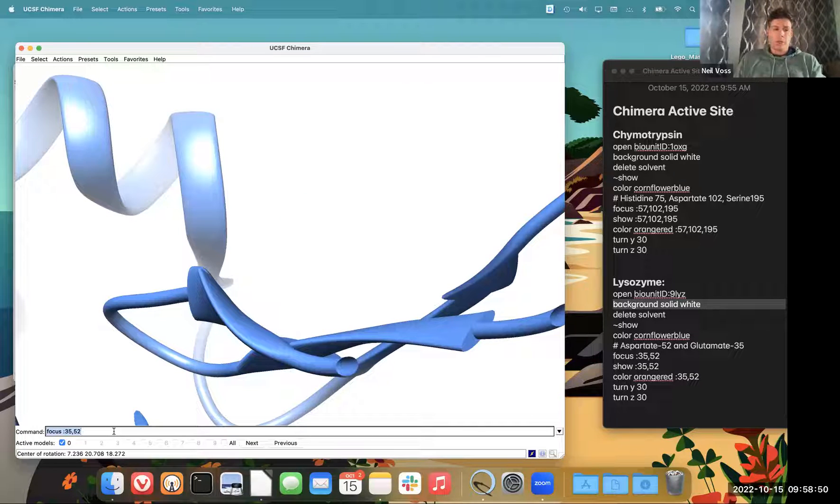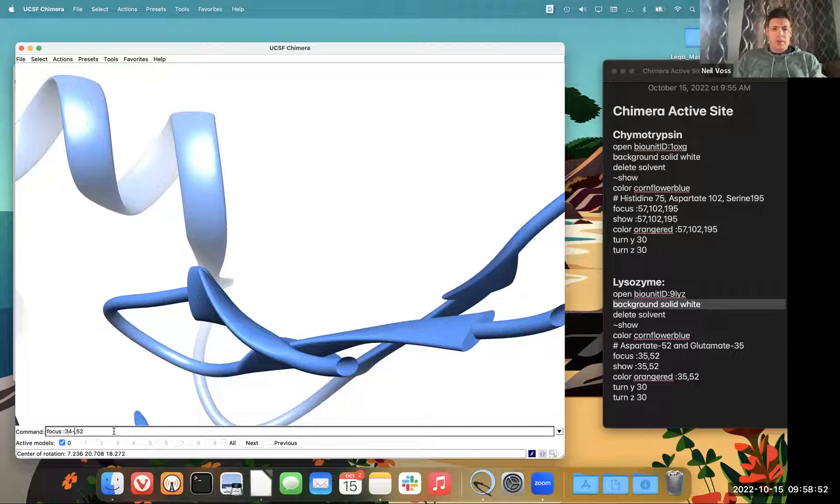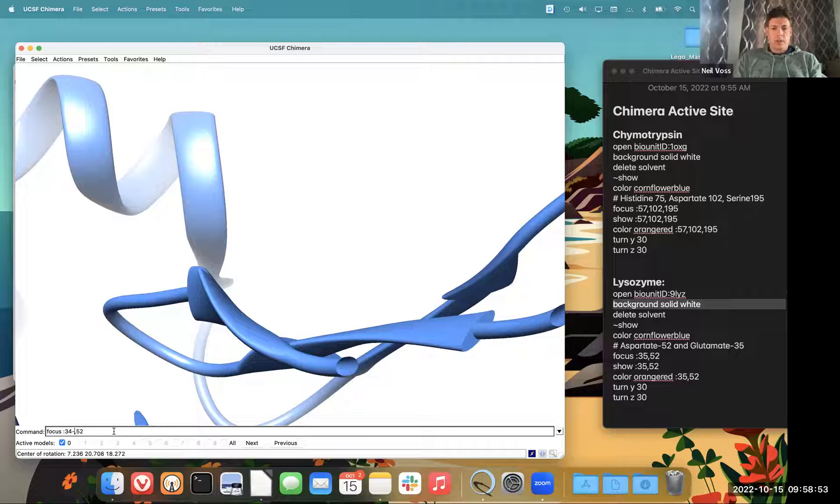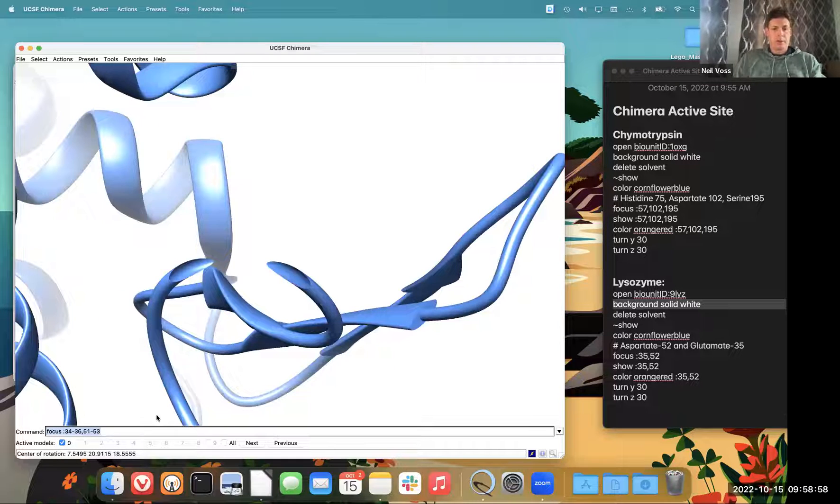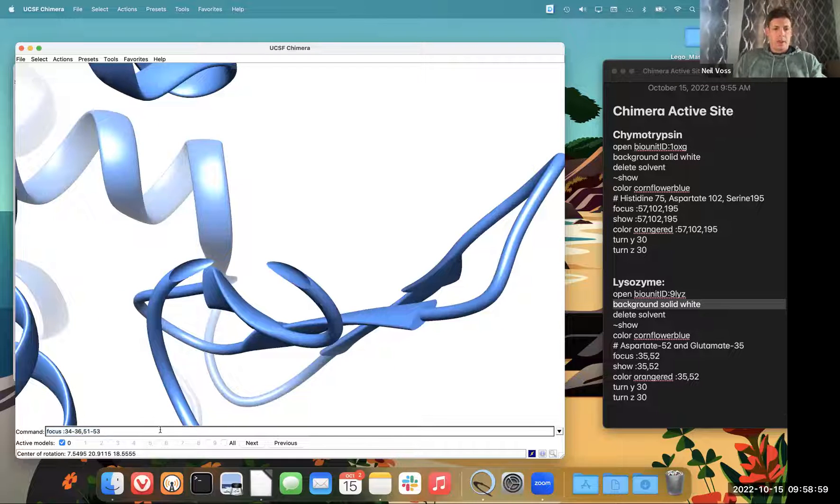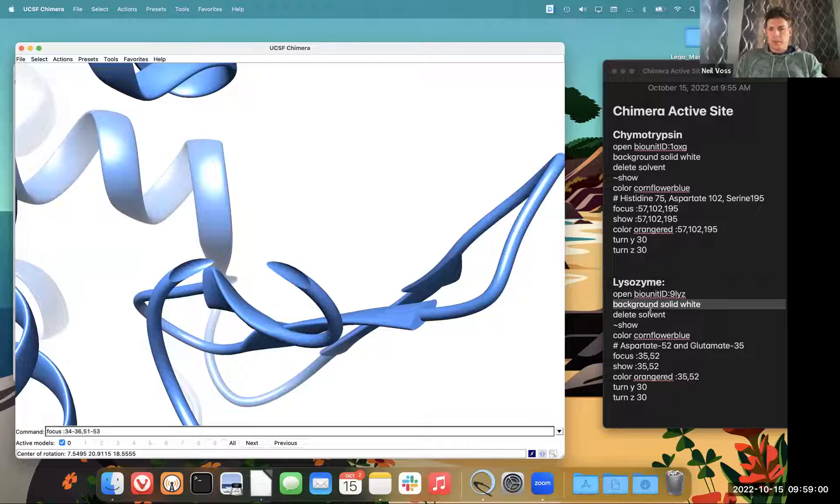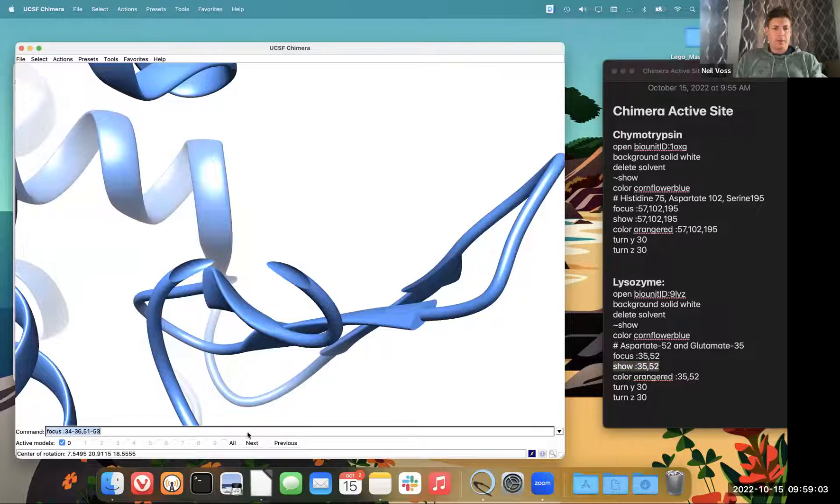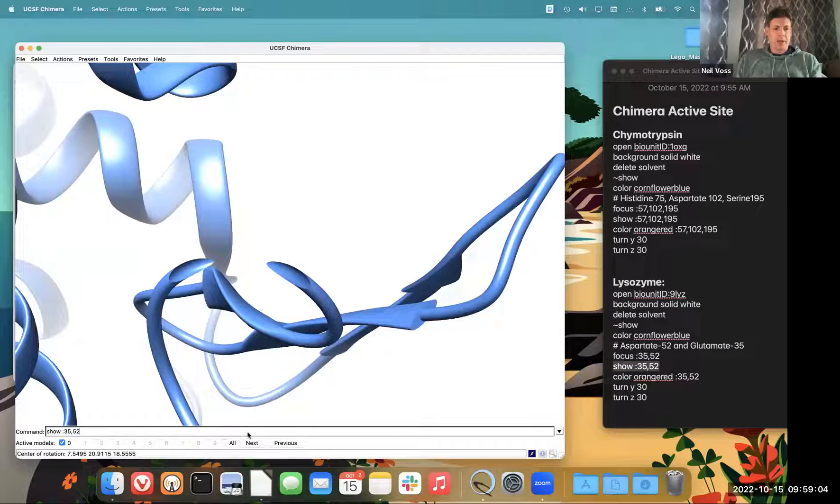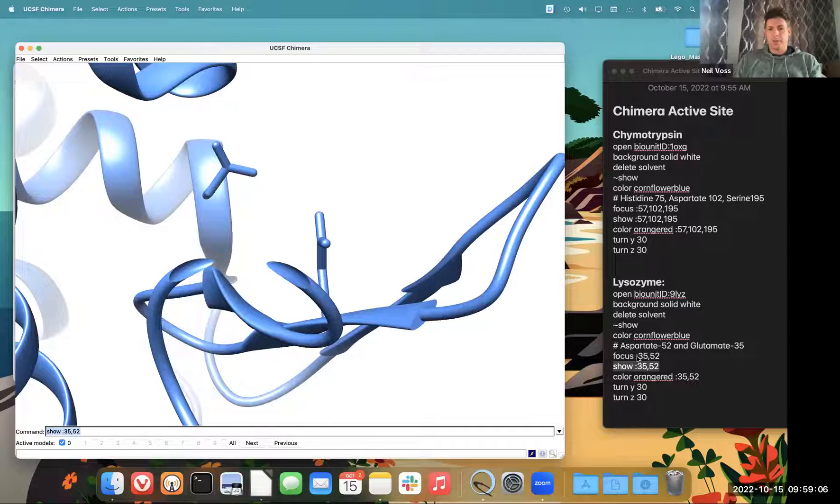Maybe it'd be better to show kind of the range, which is not something I tried earlier. So now I want to show 35 and 52, because those are my active site amino acids. Your assignment might be different.